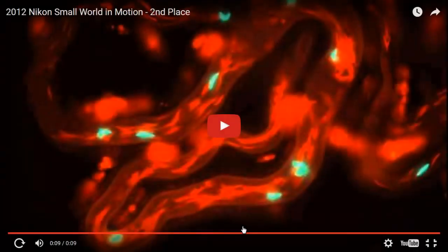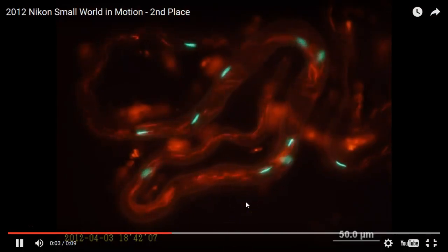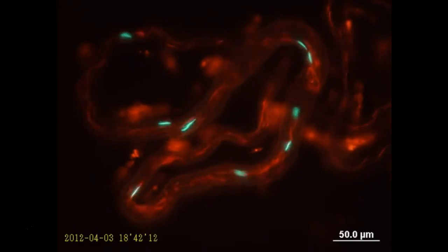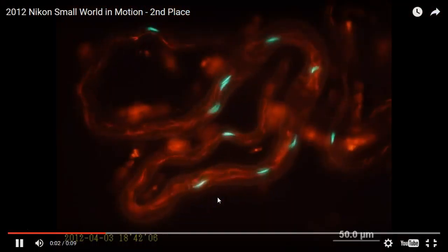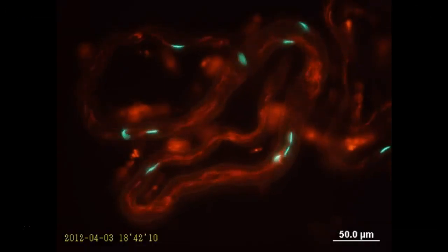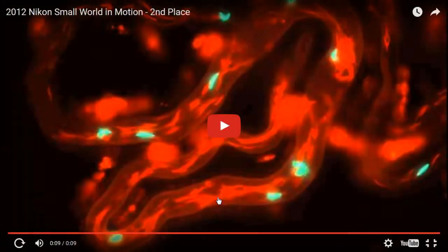So this is done probably with magnification, with a microscope or a lens of some sort. The really cool thing is if you look closely, you really see the green guys, the green sperm swimming around. But now look, you can see the red ones now too. So what they did is they made one male fruit fly's sperm red, and the other male fruit fly's sperm green.